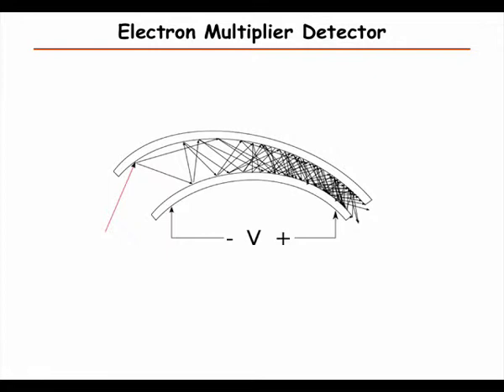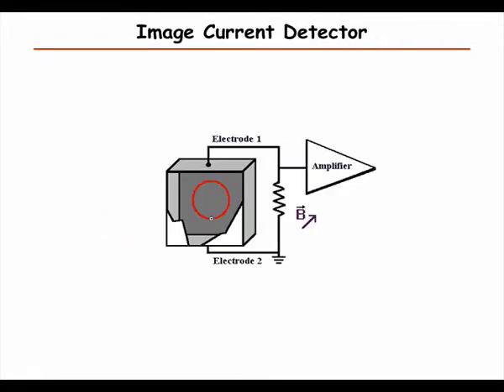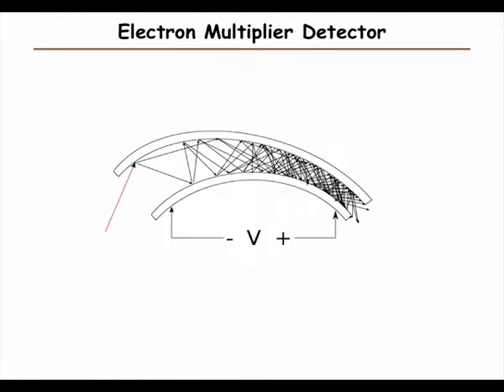It's usually in some kind of glass plate that's coated in some way, so that you can have many small channels like this. Here you destroy your particle, I mean your molecule that you're measuring.